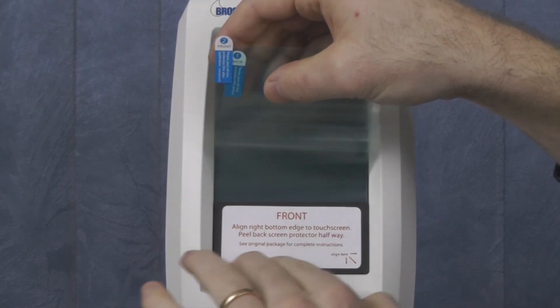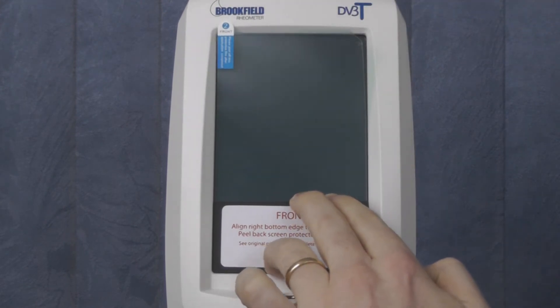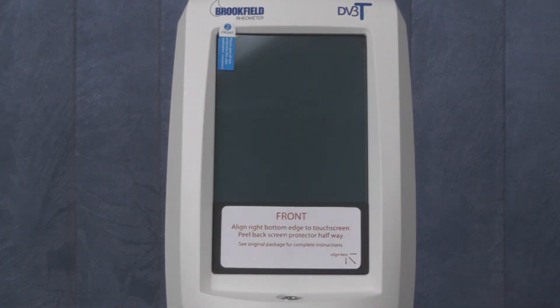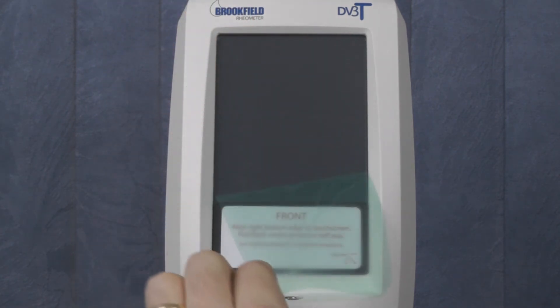Once aligned, gently press the exposed side of the protector against the screen, and then continue to peel back tab 1 until it is removed. You can press the top of the screen protector to ensure it is applied correctly. Once applied, peel back tab 2 all the way to remove the backing and complete the adhesion process.